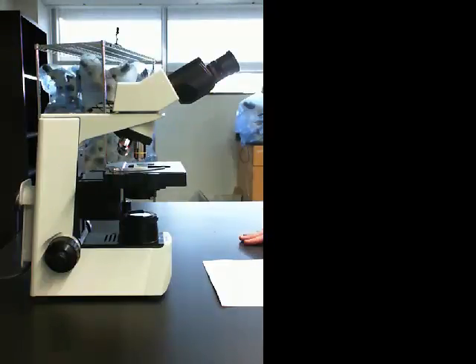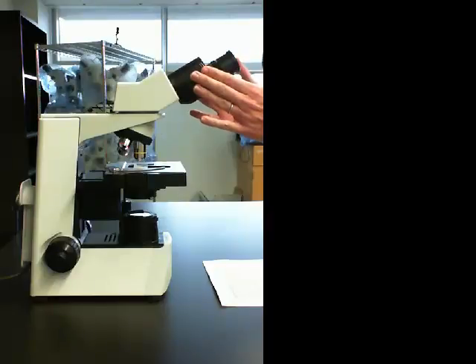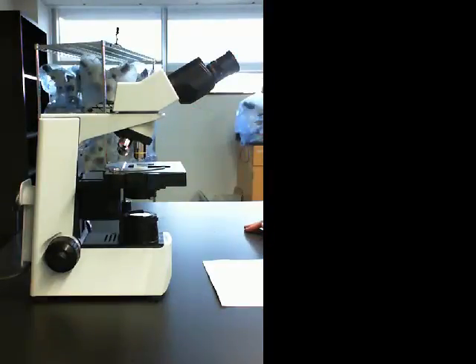Also, to dramatically improve your comfort and skill with a microscope, you should spend time adjusting the ocular lenses for your eyes. Imagine, if you will, getting into a car that you've never driven before. Maybe it's a parent's or a friend's car, and obviously the mirrors are not in the right place, the seat's not adjusted to the right place, and it's going to be really uncomfortable to drive that car. And in fact, you might not be able to see cars behind you or next to you based on where those mirrors are focused. So when you get into a car that's not yours, you're of course going to adjust it. You're going to move your seat. You're going to adjust your mirrors, or at least you should. So we should do the same thing with a microscope when we go to use it.